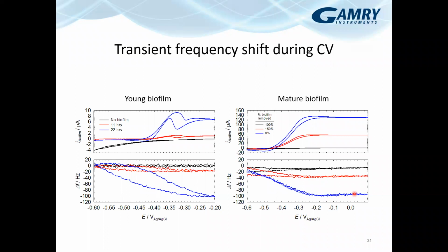So the EQCM, you know, coupling the electrochemistry, then the QCM, and then some other sensor. If that sensor is an electrochemical sensor, like a pH microsensor or an amperometric sensor, you have to be careful of the crosstalk and ground loops and other issues between the potentiostat that you're using for the EQCM and that sensor.